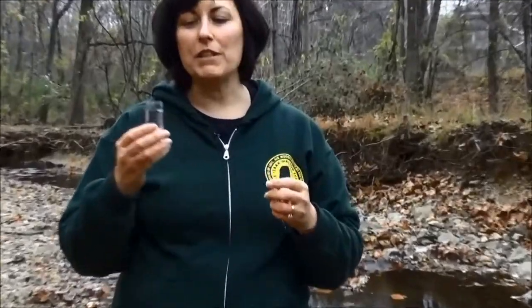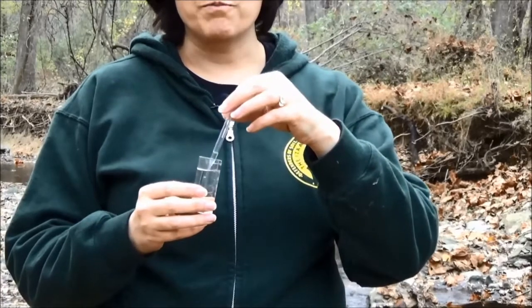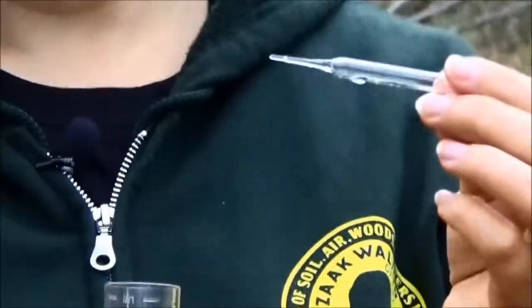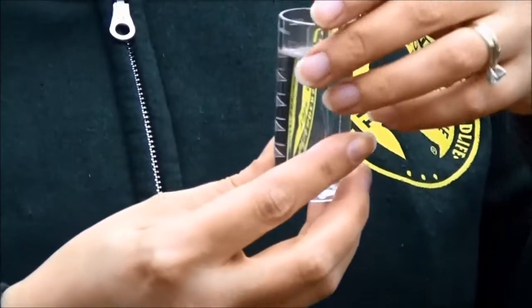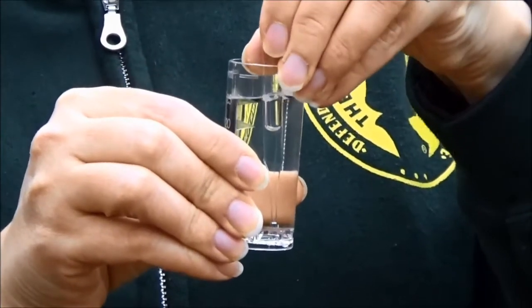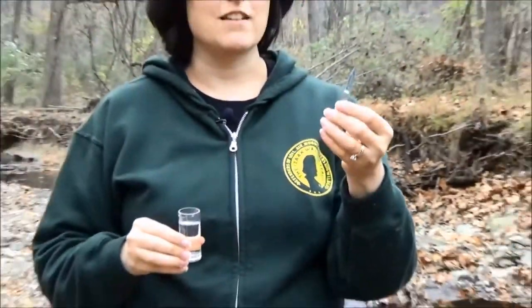Now we're going to measure dissolved oxygen. This is a very important measurement because all of our aquatic life need to get their oxygen from the water. What we're going to do is take your clean sample of stream water, and you have an ampoule — we're going to break this ampoule in the water sample. It's very narrow up at the end, so all you need to do is put that narrow end all the way to the bottom of your sample and push it against the side until you hear it crack.